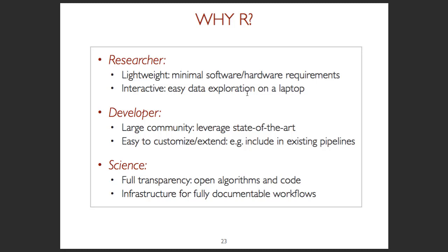So you can also work with it that way. And from the science perspective and reproducible research perspective, we feel that working in R and in the command line environment is the best in terms of transparency and documentation. So every single step has to be programmed, therefore it has to be documented. And the algorithms and the code are open to reproduction, open to criticism, and you can incorporate this again in a workflow which is fully documentable.